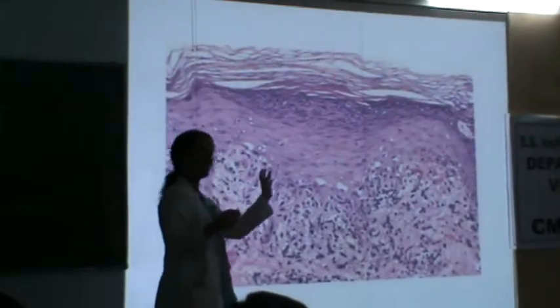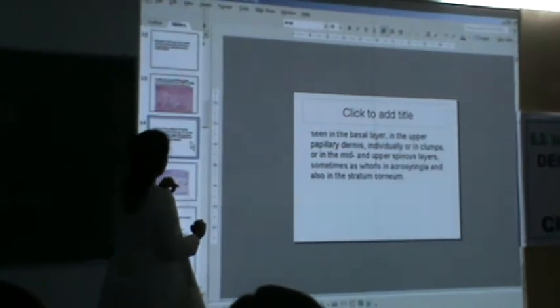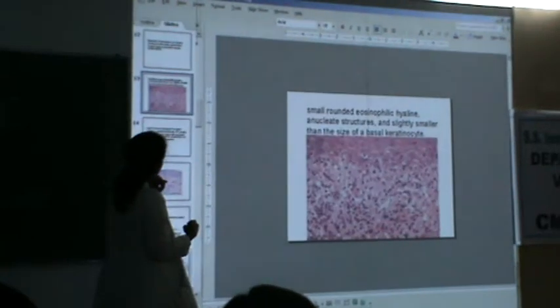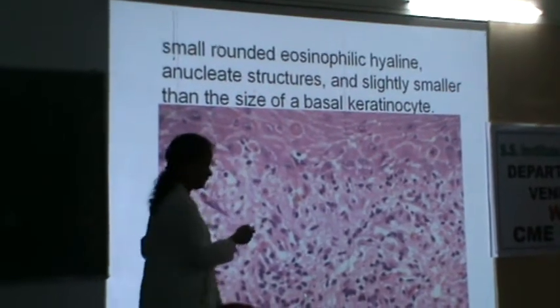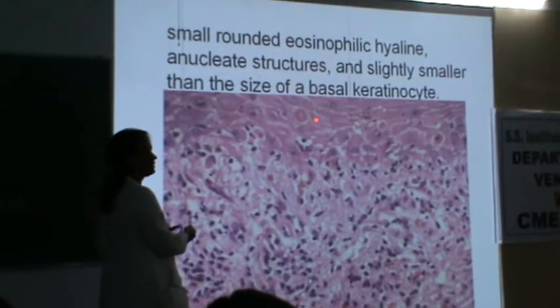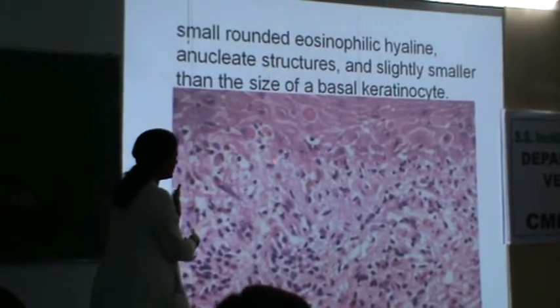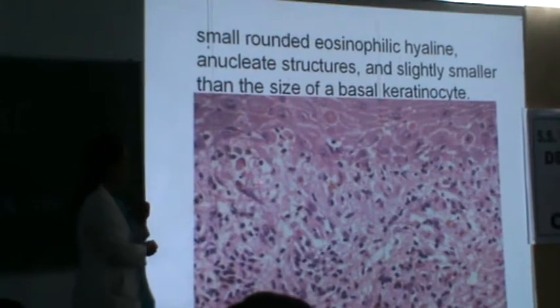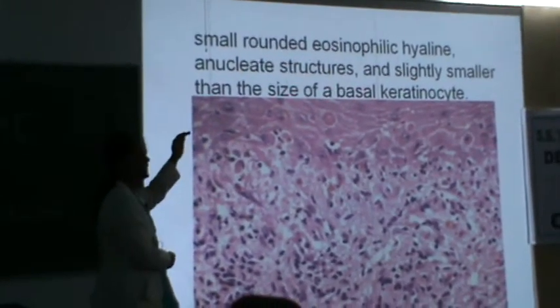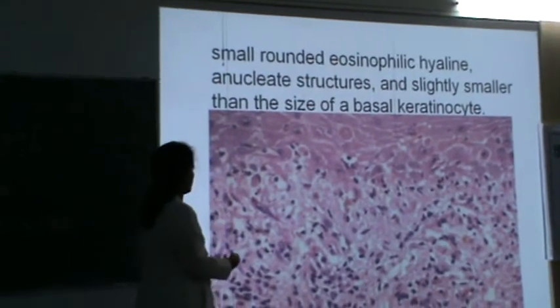Can you appreciate the keratinocytes which are necrotic — the colloid bodies, the civatte bodies? Where are they present? Most often we see them in the basal layer, and we do see them in the papillary dermis too. Sometimes they could be seen up to the keratin layer. So civatte bodies and colloid bodies are part of the picture, though we do see them in many other conditions as well.